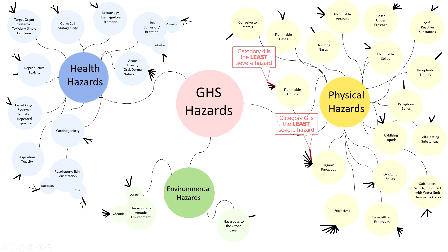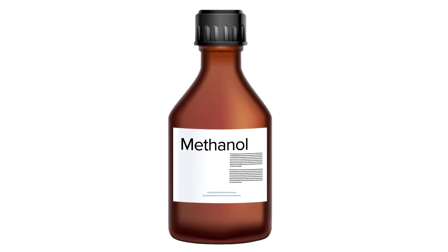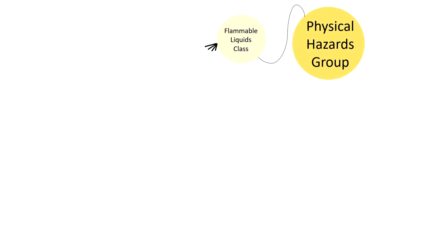When you are evaluating chemicals for use in your classroom, minimize chemicals in low categories. The next part of the video will illustrate the GHS, including labeling information for methanol's physical hazard of flammability. When we look at a safety data sheet or PubChem for information about methanol, we see that this common solvent is considered a flammable liquid, which is one of the 17 classes in the physical hazards group.